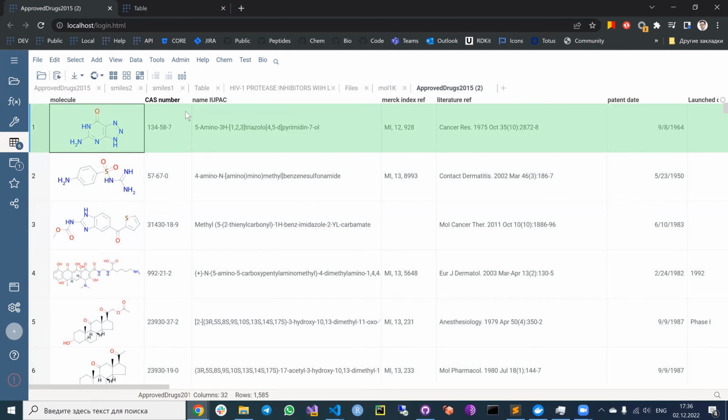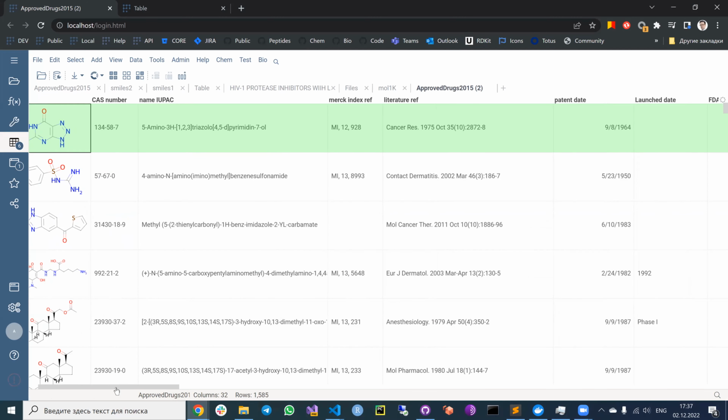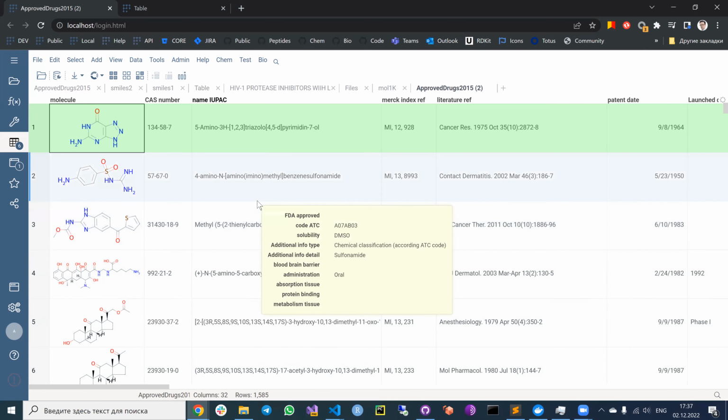It was okay, but it removed the field that was not present for the first entry. I vote for keeping all the fields.